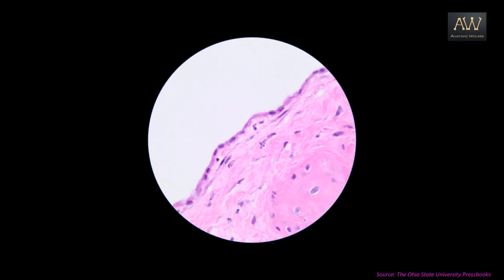This slide is another example of the junction between the free space and the tissue. As you can see the flattened nuclei, these represent the squamous epithelium forming the junction between this free space and the tissue. So this epithelium is probably the mesothelium.